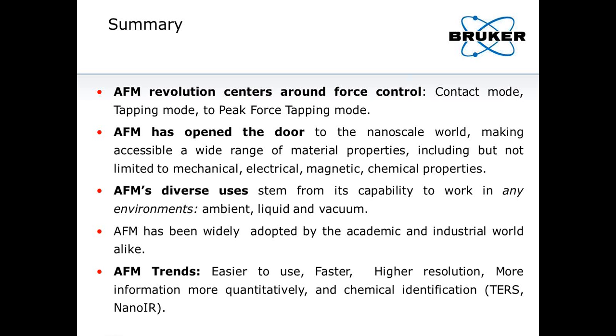And the lithium battery, that was also done in liquid? Yes, the lithium battery sample is done in an electrochemical cell that's designed for the Dimension Icon AFM. Actually, for that cell, it's not only in liquid, it's an organic solvent. And if you know about lithium batteries, which I believe most of you do, lithium is quite reactive in air.